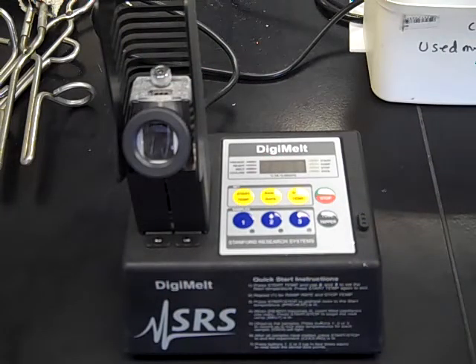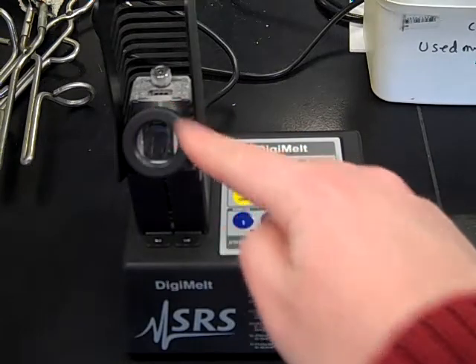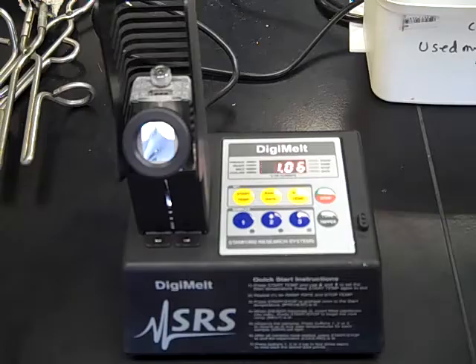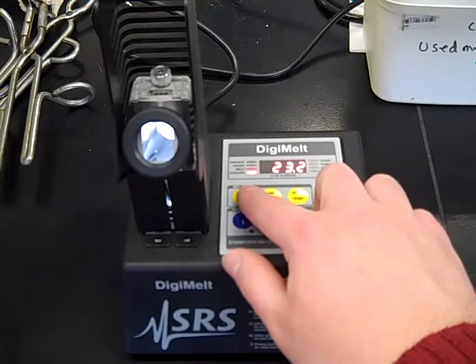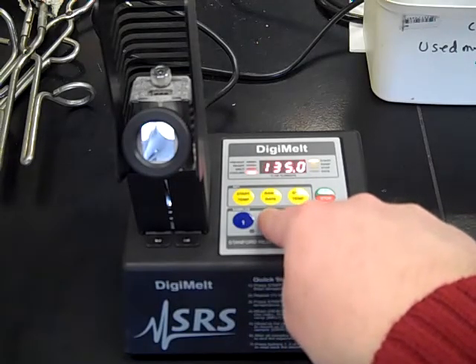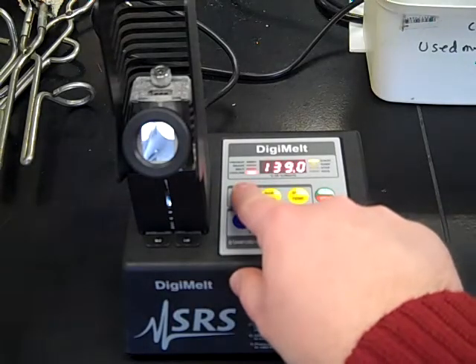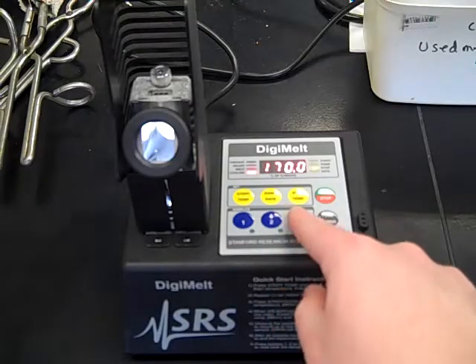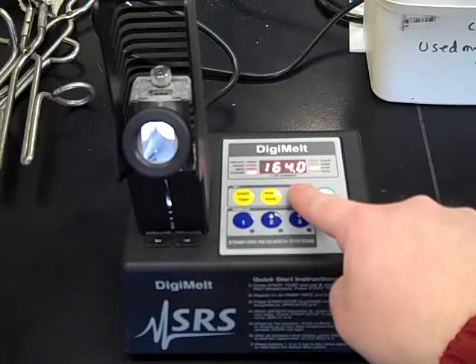Once you've filled your capillary tube — and note that three can actually be run in this machine at the same time — turn on the MeltTemp using the switch at the back left corner. The first thing you want to do is set your start temperature and stop temperature. Since my compound has a melting point of 159 degrees, I'll pick a range about 20 degrees below and five degrees above. So I'll set the start temperature to 139 — once set, click start temp again — and the stop temperature to 164, then press stop temp again.